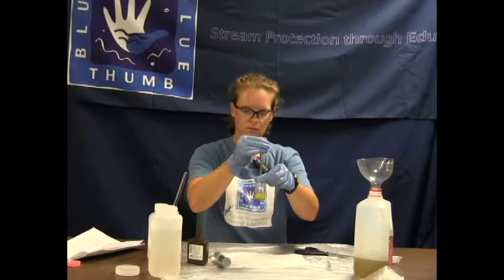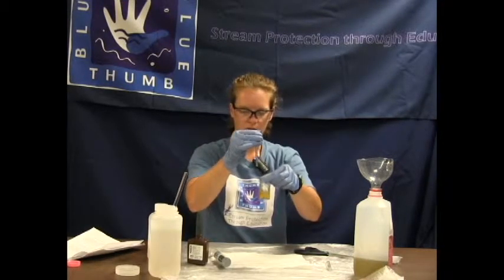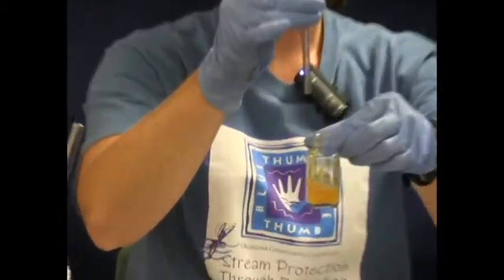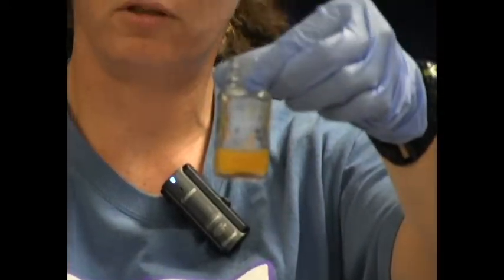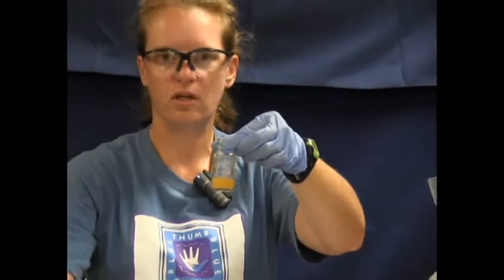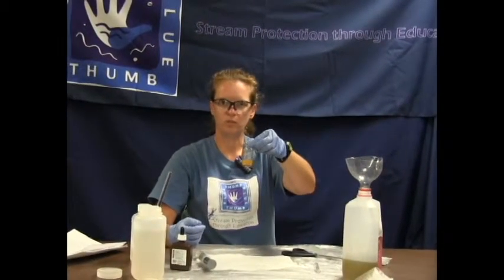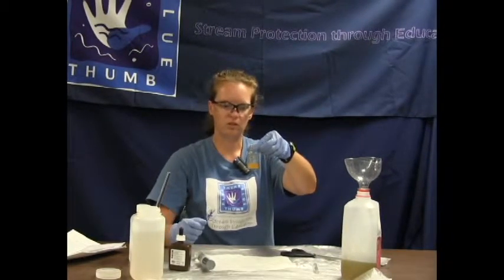2, 3, 4, 5, 6 — and that does it. We have our color change that has stayed. So that took 6 drops. Remember, this is the high range test, so we are going to multiply our number of drops by 20. So this would equal 120 mg per liter of chloride, and that is what we would write on our data sheet.